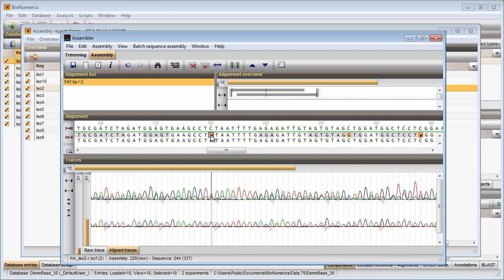Updating one of the trace files automatically updates the consensus sequence. I will save all changes to the database.